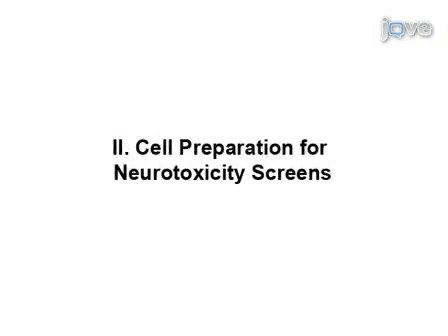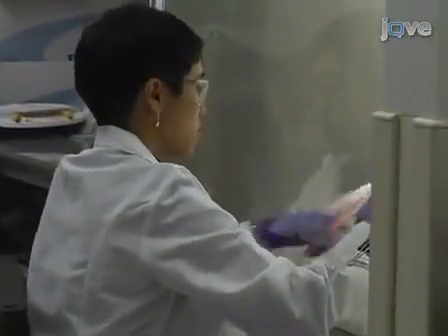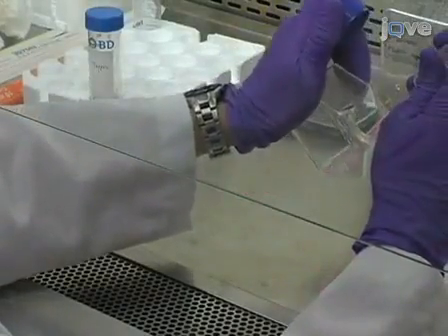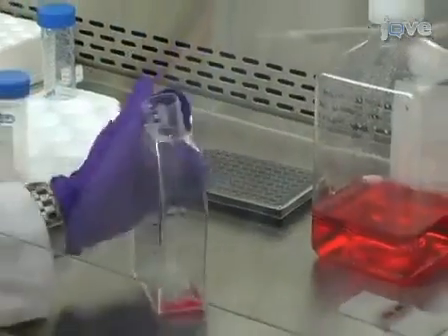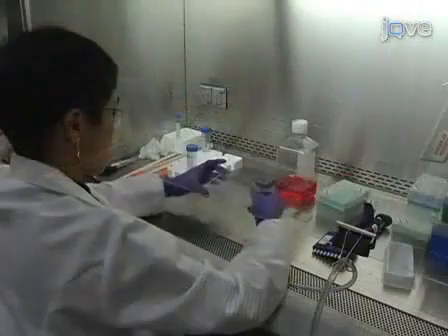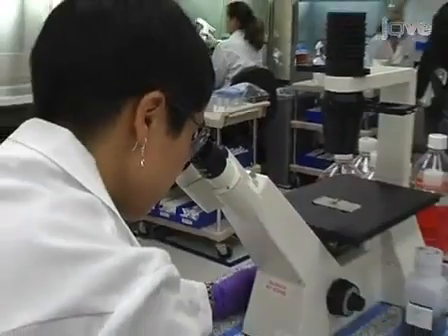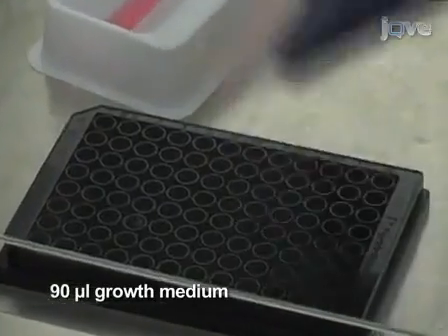High-content screening for neurotoxicity begins by seeding neuron astrocyte co-cultures in 96 well plates. Once co-cultures have grown to approximately 70 to 80% confluency, detach them using trypsinization. Cells should be counted and adjusted to the appropriate density for the assay before they are seeded in the plates in 90 microliters of growth medium.